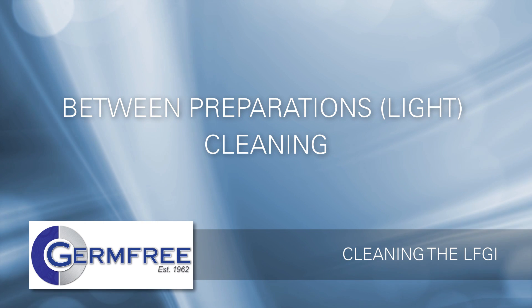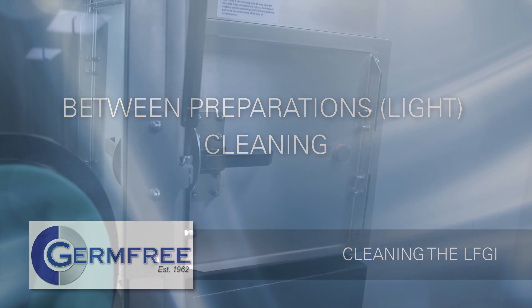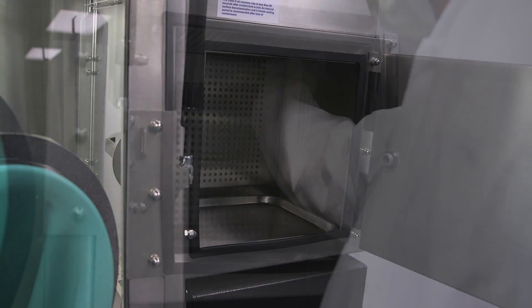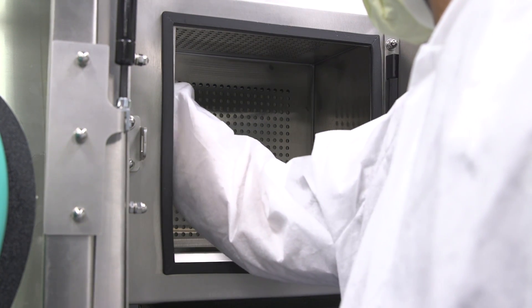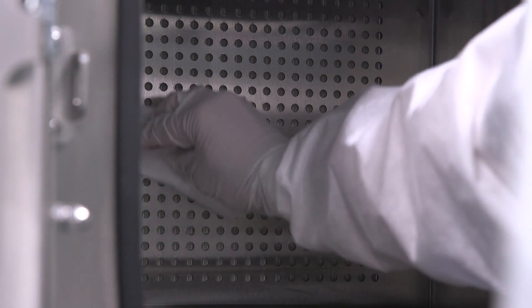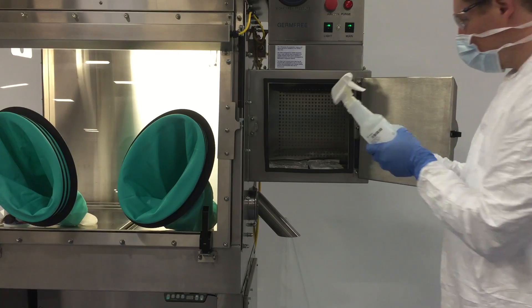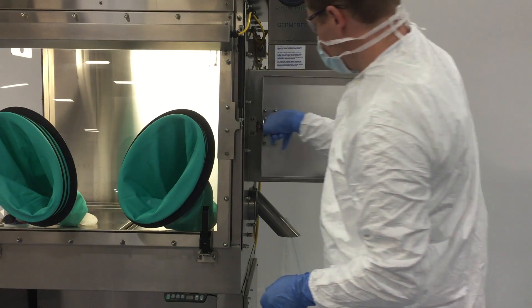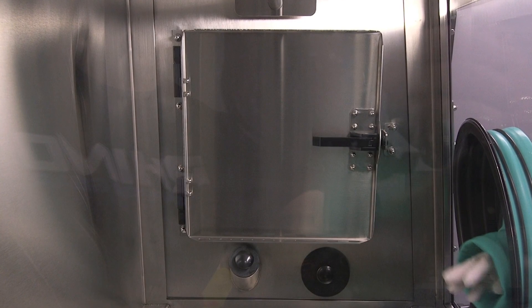Between preparations, it is recommended that you perform a light cleaning to reduce the risk of cross contamination. Open only the outer door of the airlock. Spray a low-linting or non-shedding clean wipe with sterile alcohol and wipe the top and back HEPA filter covers. Spray the remaining surfaces, including the tray, with sterile alcohol and wipe with overlapping strokes. Leave the spray bottle in the airlock and close the outer airlock door. Run a purge cycle. Open the inner airlock door and remove the spray bottle.